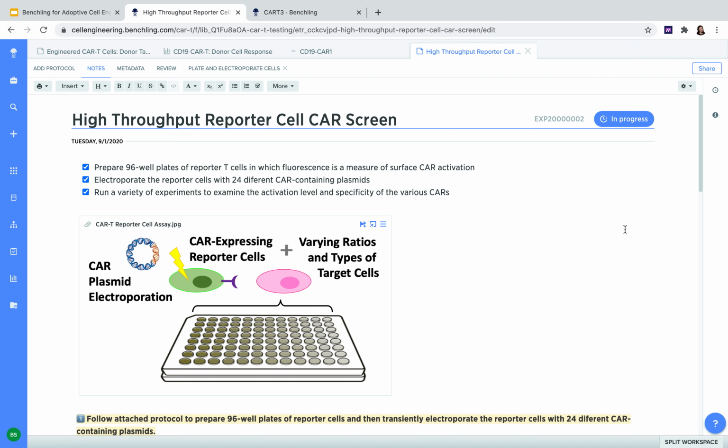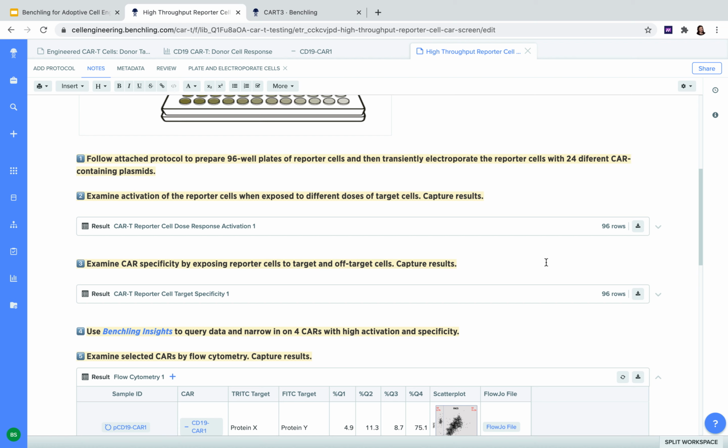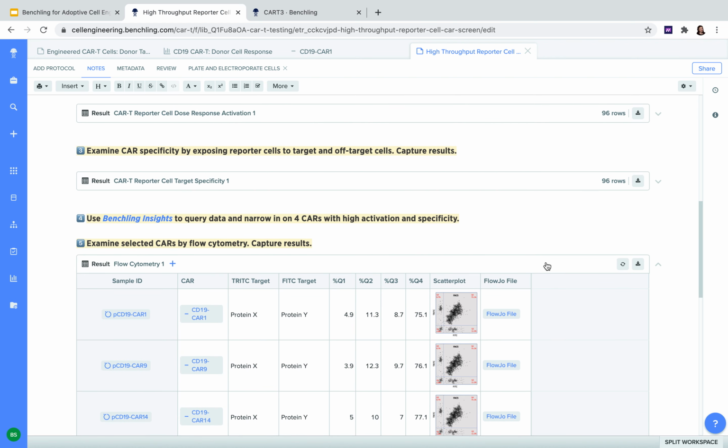Thus, as a downstream translational scientist, I can jump into this CAR gene, see results captured by the most upstream lead generation team, and if I have any questions about how those results were generated, I can jump right back into that upstream entry and see all of the experimental details for how those results were captured.